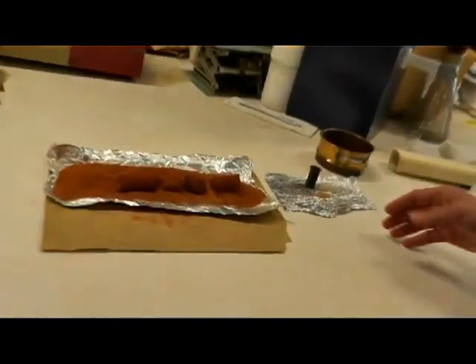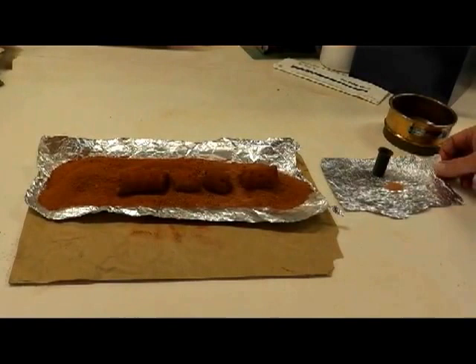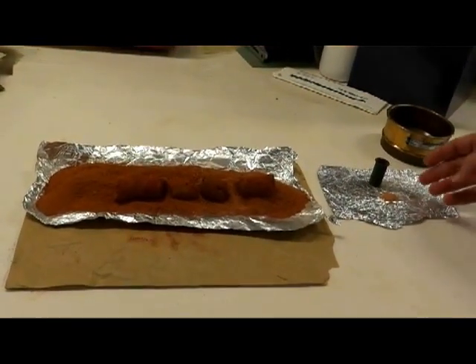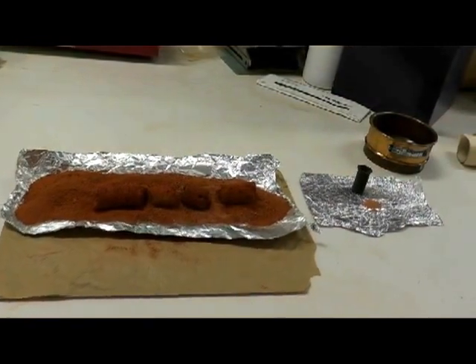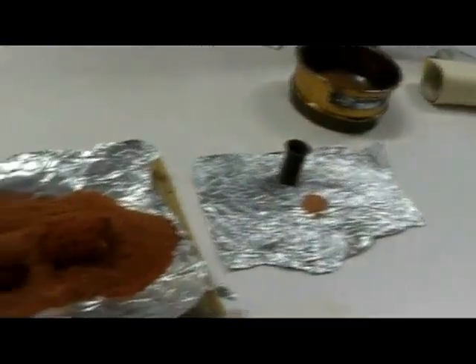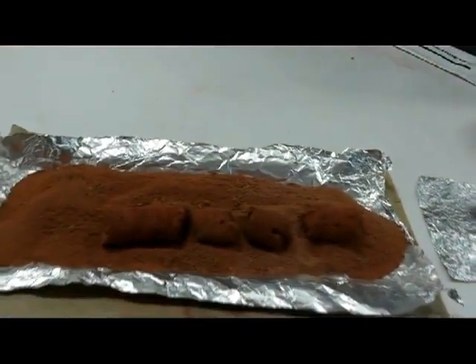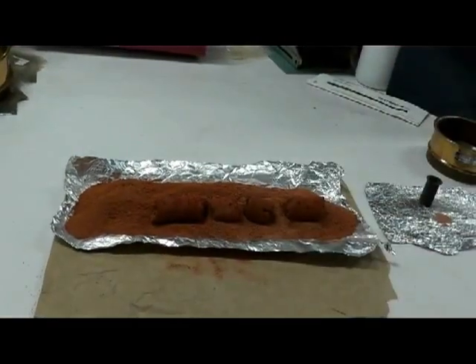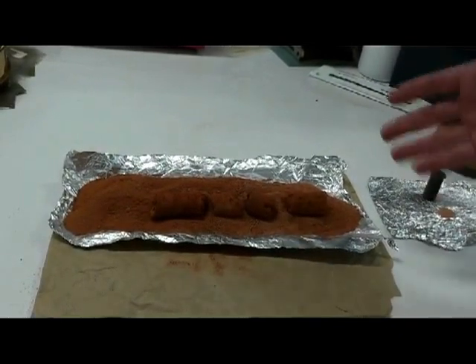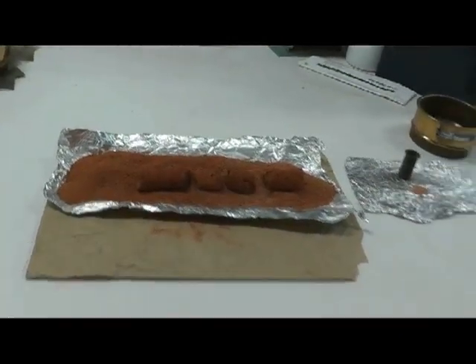To put the soil carbon bench in perspective, the standard analytical method allows you to determine a maximum of half a gram, 500 milligrams, typically this amount. Whereas in the soil carbon bench, we can, by combustion, analyze how much carbon we've got in core material, which is about the mass we're seeing here, 300 to 400 grams worth.